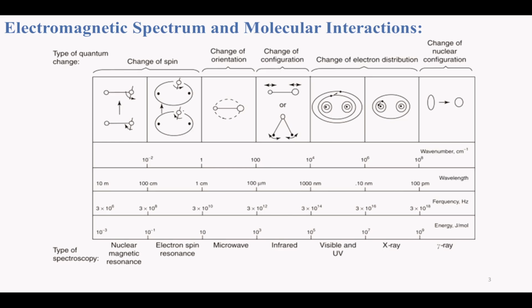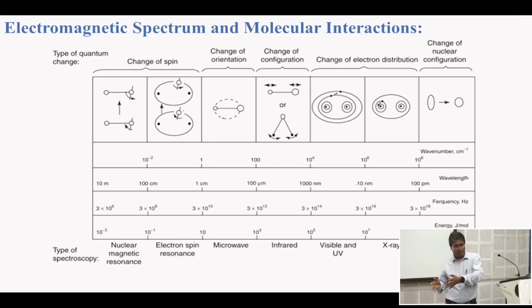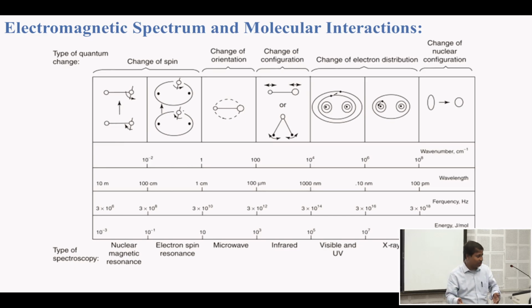This is really big. Nobody works in all the spectroscopies. Even nobody works in one spectroscopy consisting of everything. Say like this person, or we, work in Raman spectroscopy, and when you talk about Raman spectroscopy, you think we do everything related to every type of molecule, but it is not true. We use mainly the condensed phase, meaning the molecule is in solution.